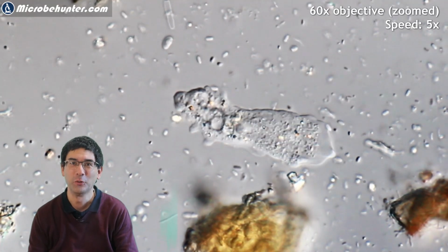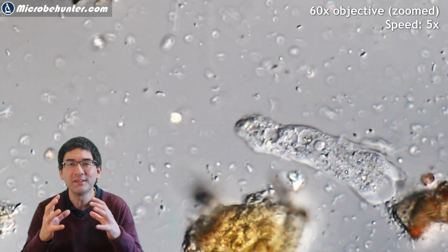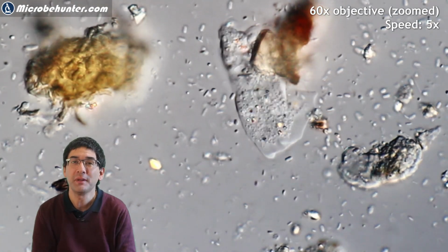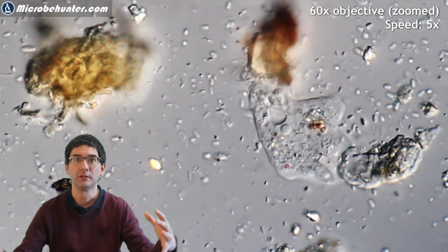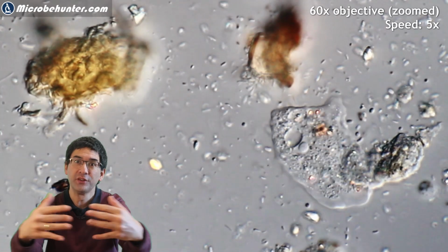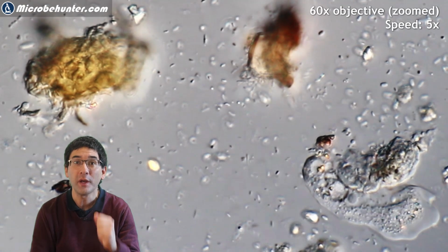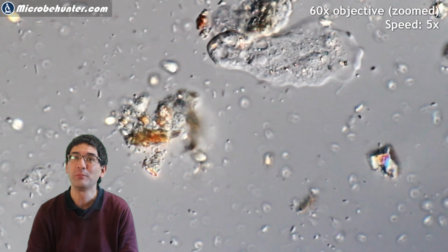So hi, Microbehunter here. This here is an amoeba. An amoeba is a single-celled microorganism that moves around by changing its shape, and this way it is also able to eat food, bacteria usually, by engulfing it, flowing around it and closing in on the other side. And in this video today I wanted to show you how and where you can find these amoeba so that you can also observe them under your microscope.